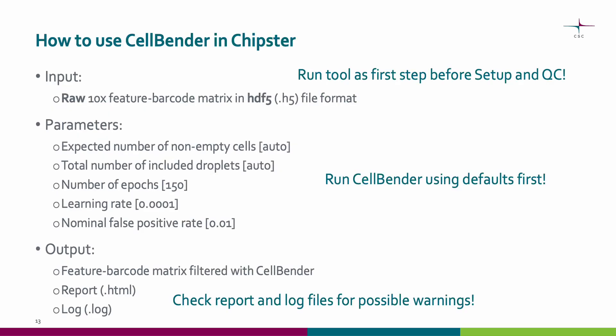Now we will look at how to use CellBender in Chipster. CellBender can be used as a first step before the Setup and QC tool. Use the raw feature barcode matrix in HDF5 file format as input to the CellBender tool. Run CellBender using default parameter values first. Then check the automated report and log files to see if changes are needed to these parameter values. These are the five different parameters available in Chipster.